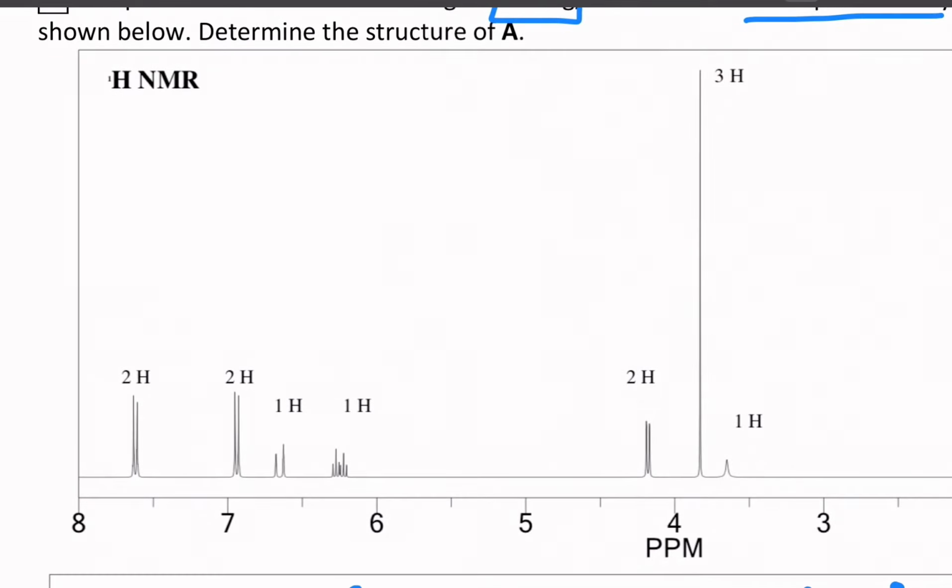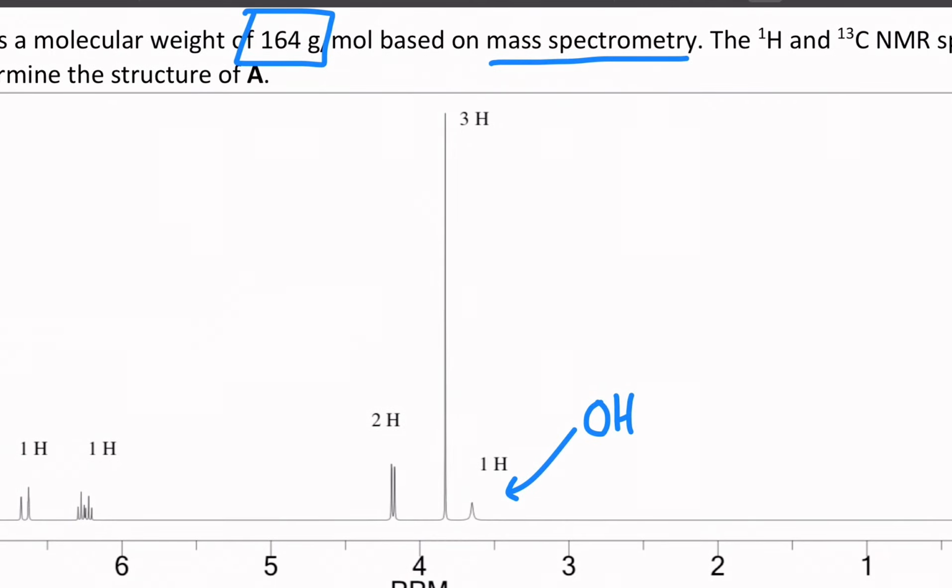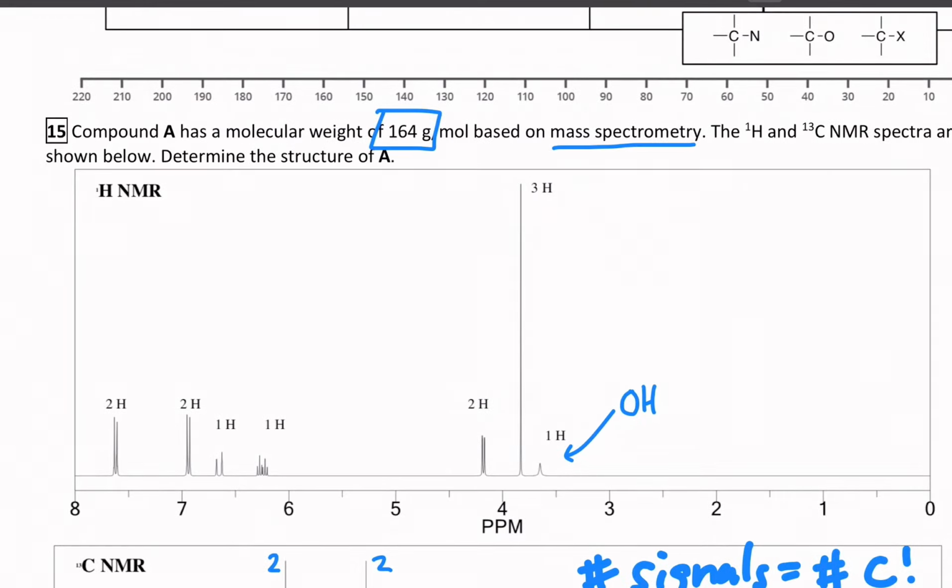And there's many things that we've seen in the past. Flanking it all the way on the right seems to be an OH group. Remember, those can show up over a broad range of part per million shifts anywhere in the 2s to 4s and beyond. But it's quite broad and a short little singlet that usually shows us the OH. We should take an IR. We'd be able to see in an IR spectrum if this had an OH or not, but they didn't give us that. But it's a good guess that it's there.